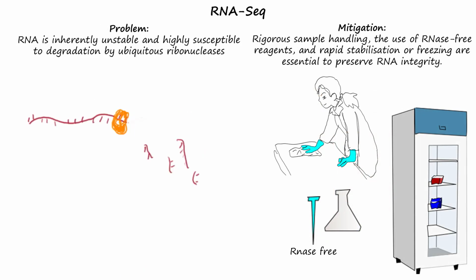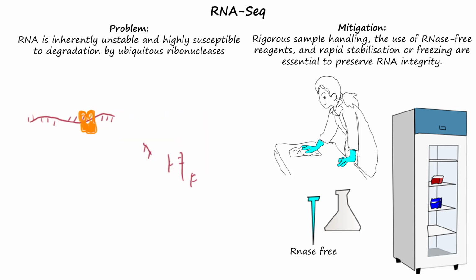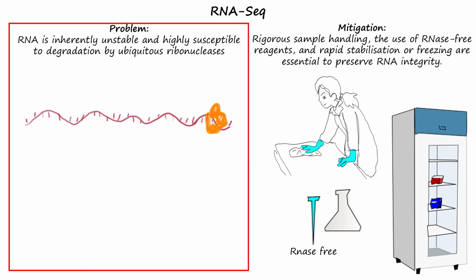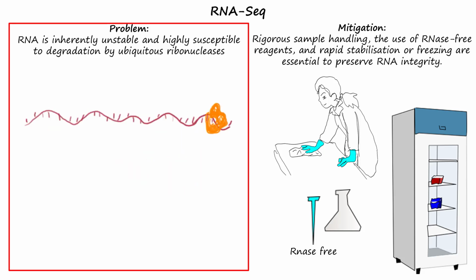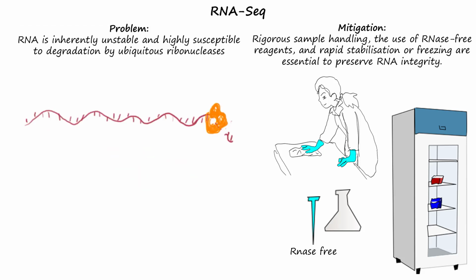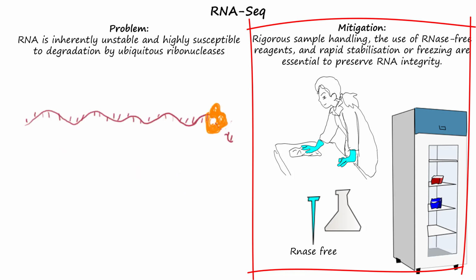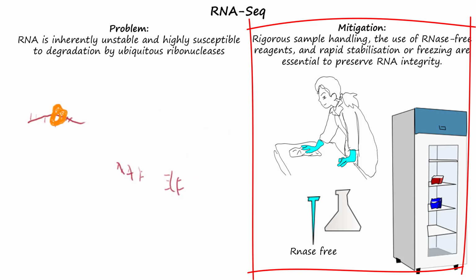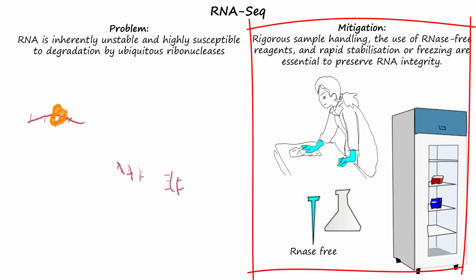Alongside this biological complexity, RNA presents a major practical challenge. It is inherently unstable and highly susceptible to degradation by ubiquitous ribonucleases. As a result, rigorous sample handling, the use of RNase-free material, and rapid stabilization or freezing are essential to preserve RNA integrity.